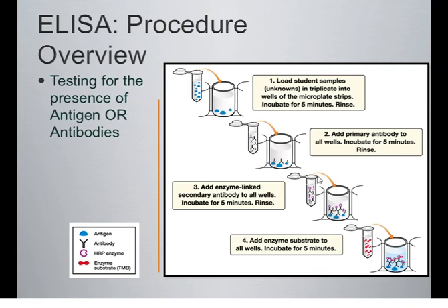So it almost creates this sandwich where on the first layer you have the protein. The second layer, the primary antibody, binds only to that, and then you wash out anything that doesn't have the primary antibody attached to it. And then the secondary antibody comes in and attaches to the primary antibody. Now, what happens with this sample is that you use a certain chemical that, in the presence of that enzyme, the enzyme will actually metabolize. It starts off as a clear chemical, but as the enzyme metabolizes it, it turns blue.